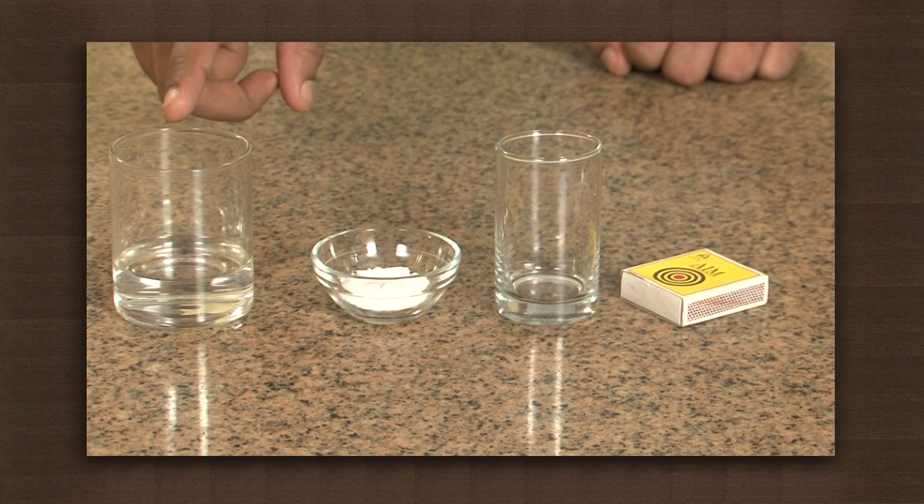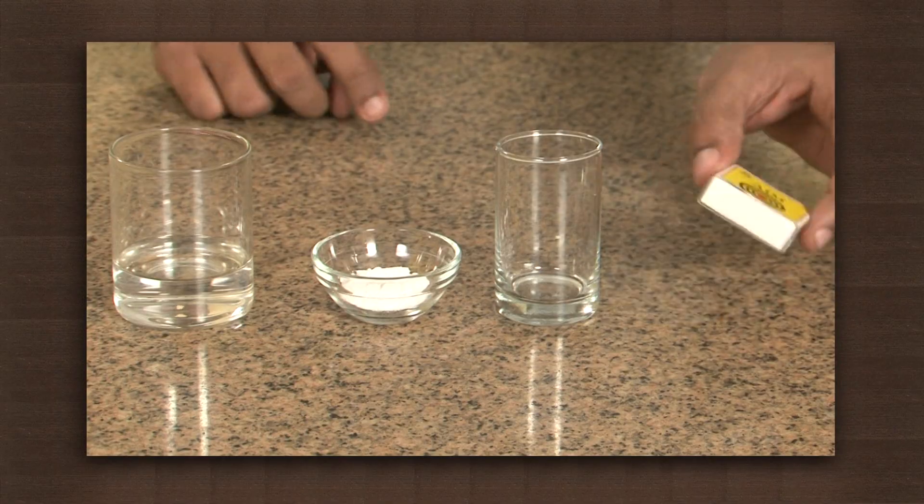You can take hydrochloric acid, calcium carbonate, beaker, and a matchbox.